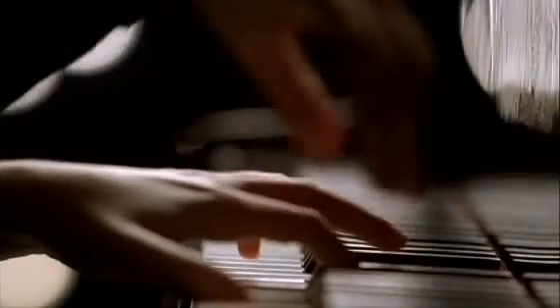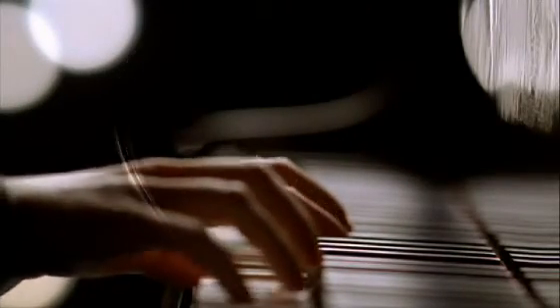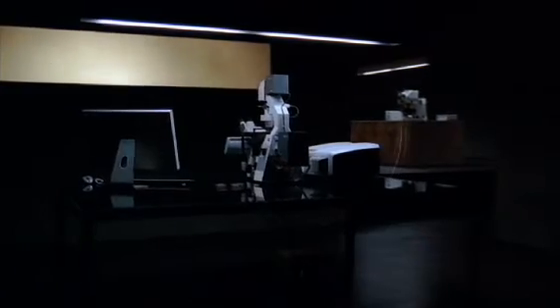The invention of the piano with its highly sensitive mechanism heralded a revolution in musical expression. A new invention in the field of bioscience now heralds a comparable technical revolution.